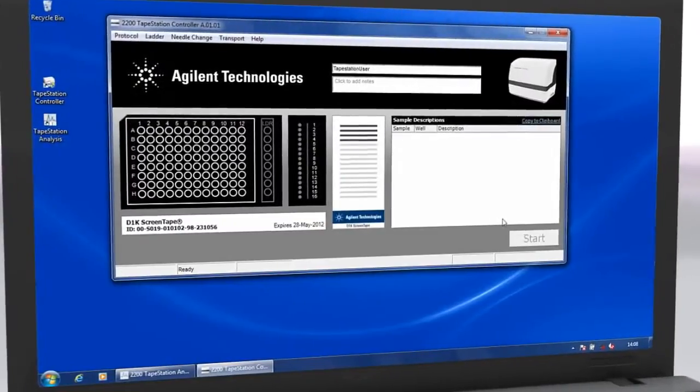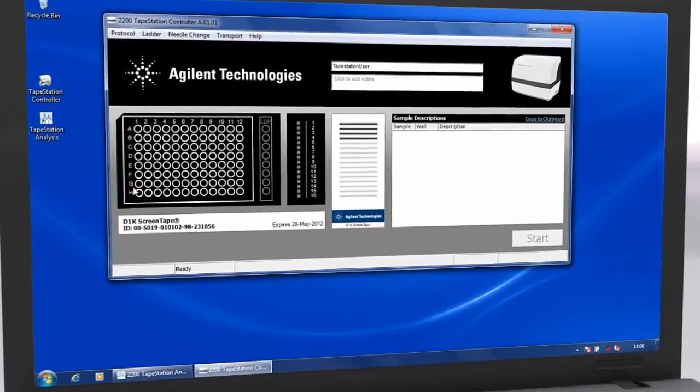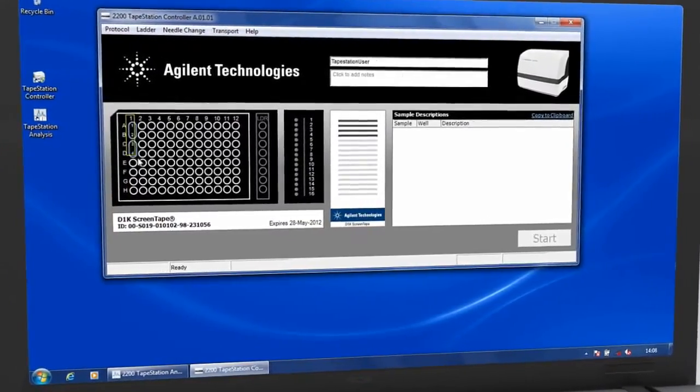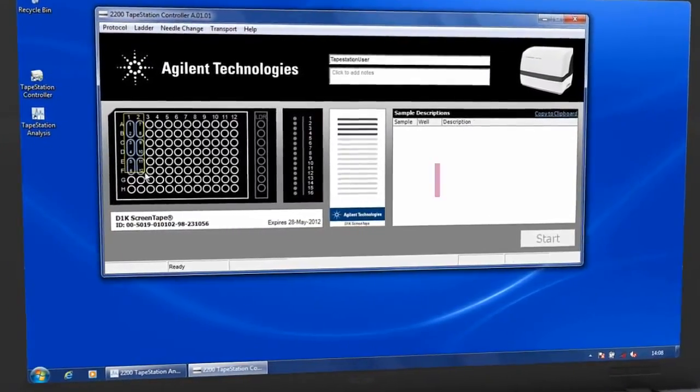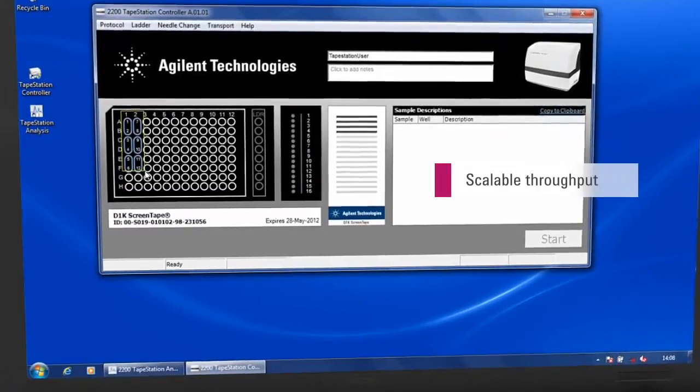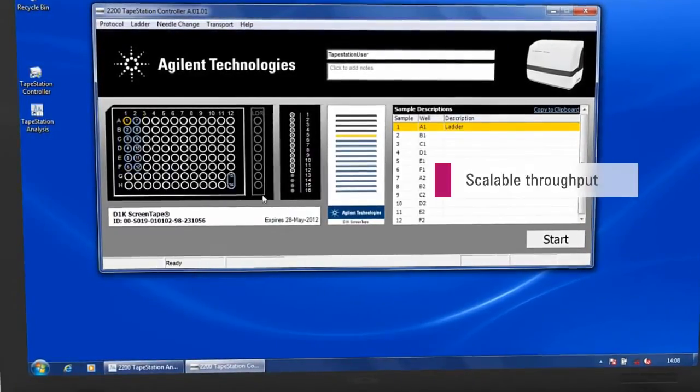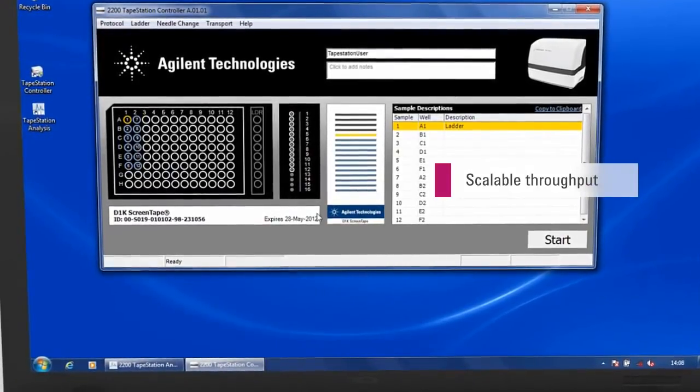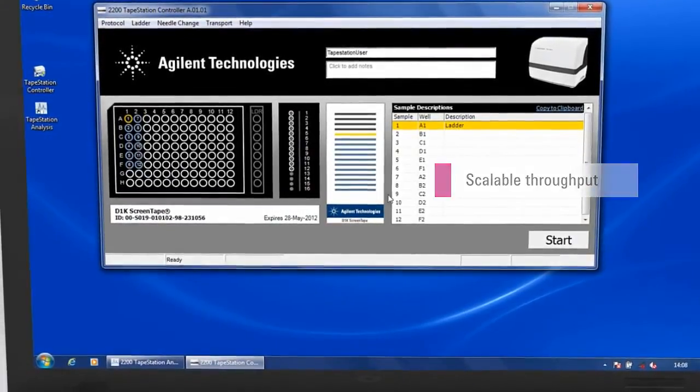Unused lanes in partially used screen tape are recognized automatically by the Agilent 2200 tape station software and can be used at a later point in time.